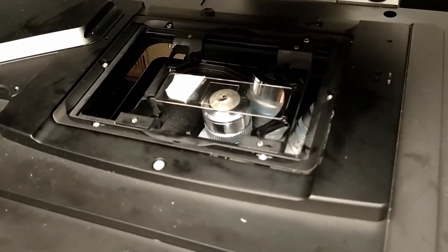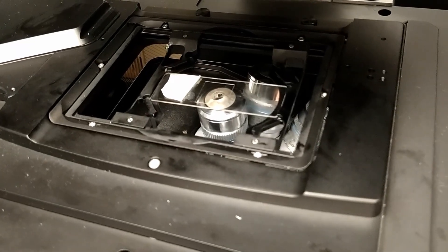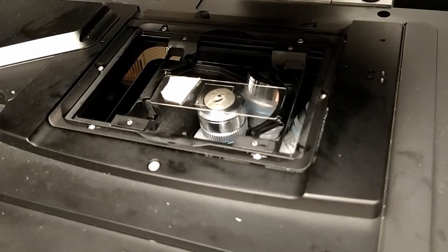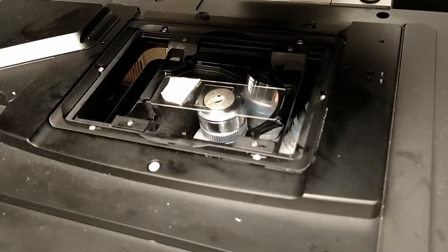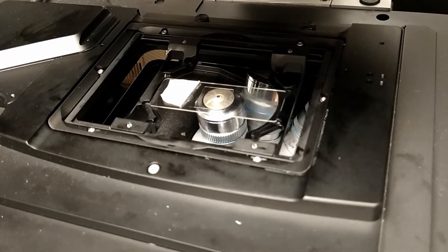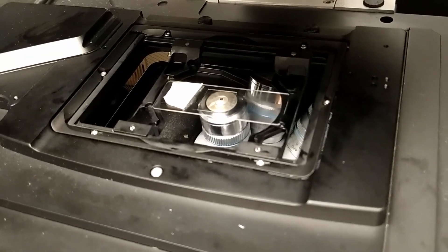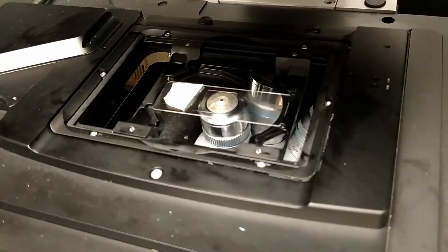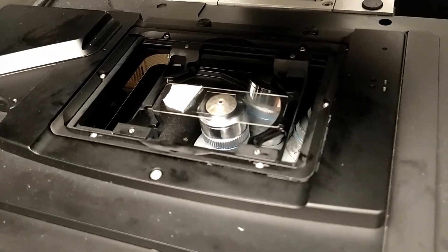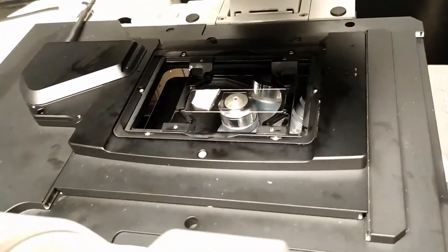When the contact is made, the oil will spread out and you're going to see it. That was the moment of contact. After this, pull the objective slightly down. By doing so, we will know that in order to focus to the sample, we need to go up from that position.